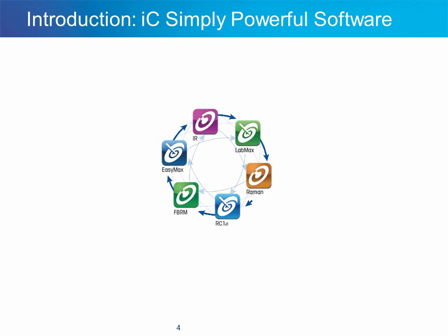I want to talk a little bit more about software, as it is one of the key enabling technologies in our workplace today. METTLER TOLEDO's IC software suite was designed from the ground up starting in 2005 to be a complete process development software solution with one common interface that allows not only seamless integration of data, but also full interoperability between instruments. Technologies can now communicate to one another and share information across technology platforms in real time via direct connection or even across a corporate intranet.